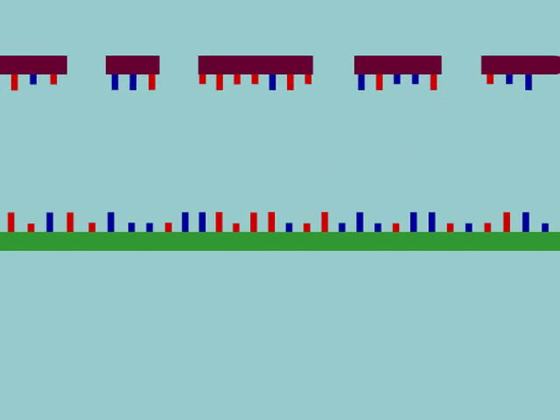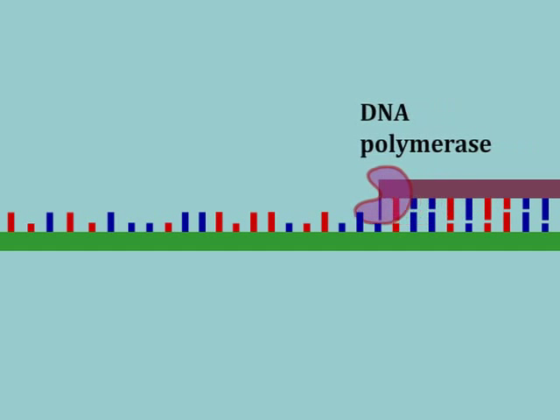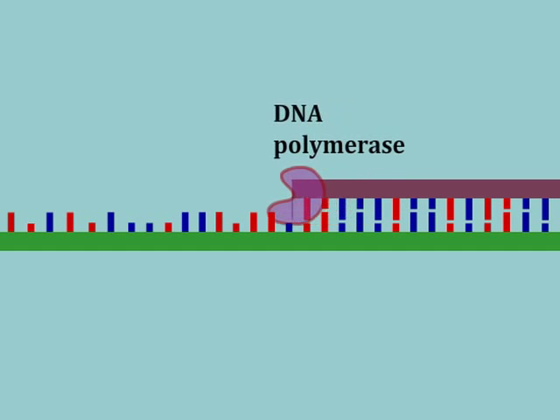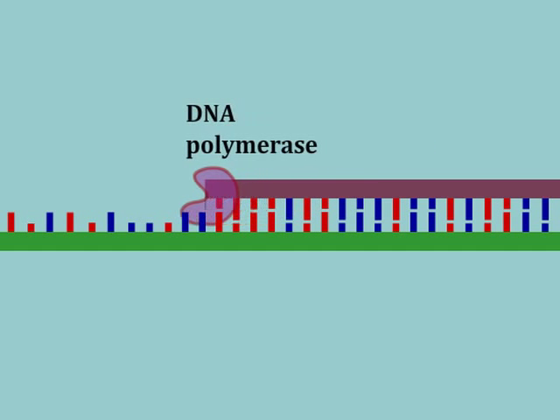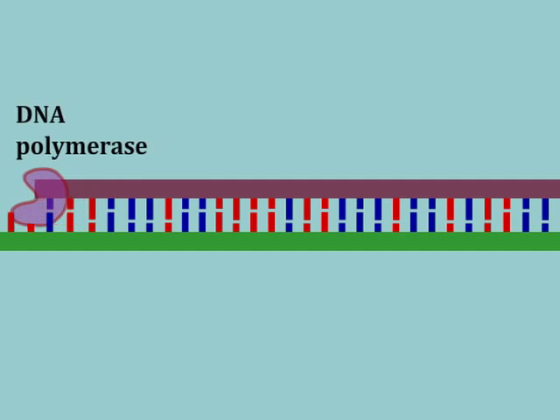Whether or not this is part of the procedure, the next key step occurs when a DNA polymerase and a primer generate a complementary DNA strand, just as in the PCR reaction. At the end of this reaction, a single strand of viral RNA has been converted to a double-stranded DNA that has the same sequence of nucleotide bases. The quantitative PCR reaction can proceed as described previously.